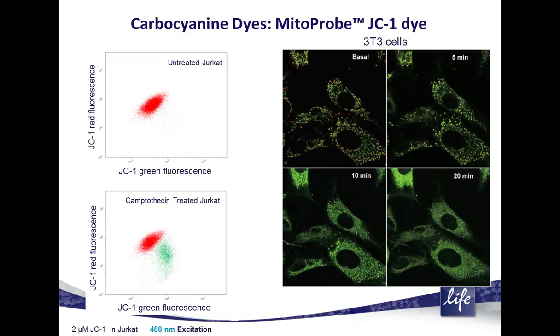The probes that detect mitochondrial membrane potential are positively charged, causing them to accumulate in the electronegative interior of the mitochondrion. JC1 is a widely used carbocyanine dye in apoptosis studies. It is membrane permeant and carries a positive charge. At lower concentrations, it fluoresces green. At higher concentration, it tends to stack into J aggregates that fluoresce red. If JC1 is used in the correct concentration range, it will stack in active mitochondria and give off red fluorescence.